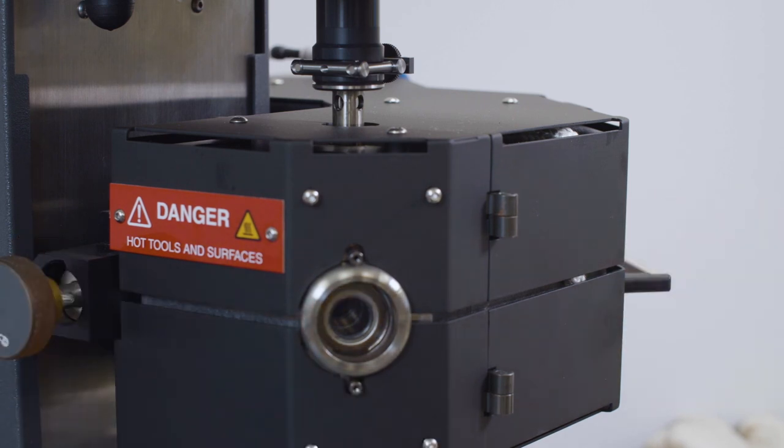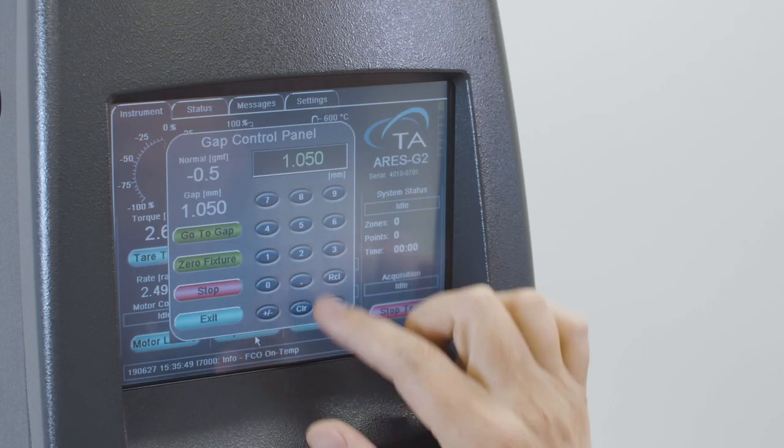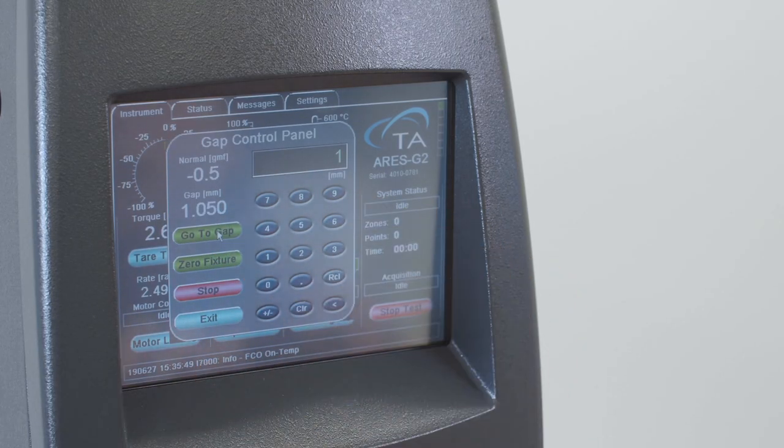Set the gap to the final measurement gap. Now you are ready to perform the melt rheology measurements.